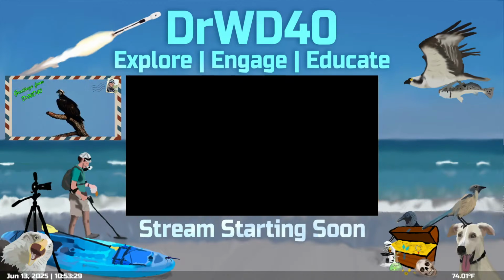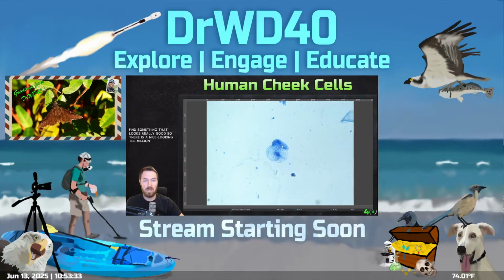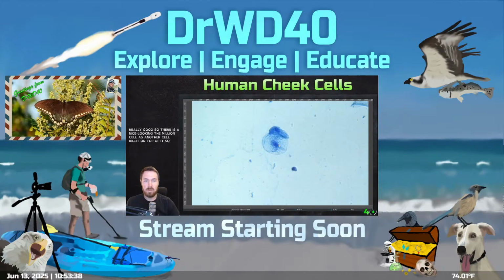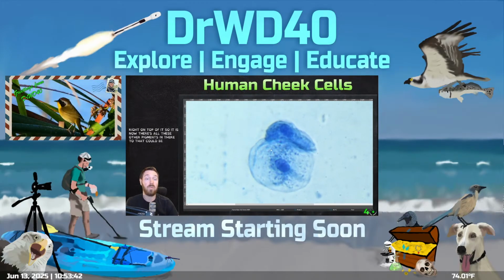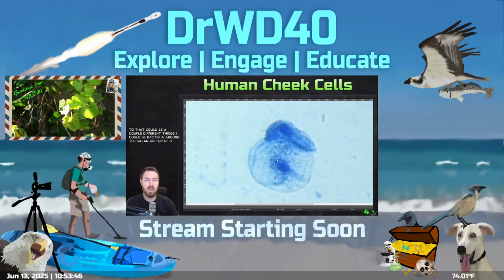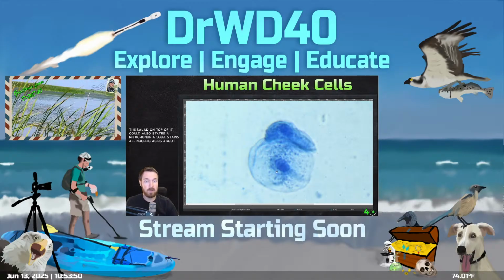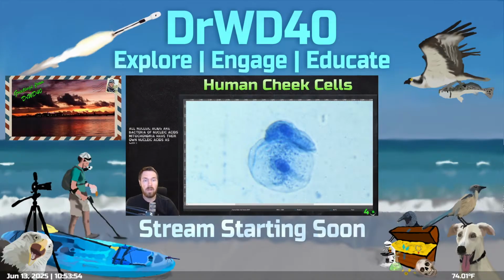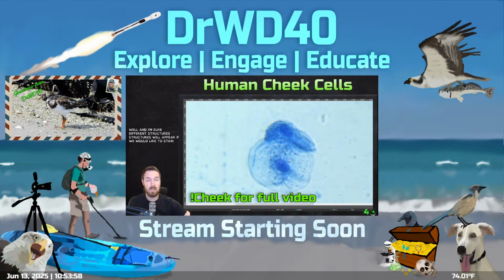Amazing. So there is a nice looking mammalian cell. Has another cell right on top of it. So, right there it is. Now there's all these other pigments in there too. That could be a couple different things. There could be bacteria around the cell and on top of it. Could also stain some mitochondria. So this stains all nucleic acids. So bacteria have nucleic acids, mitochondria have their own nucleic acids as well. And I'm sure different structures will appear if we would let this stain sit a little longer.